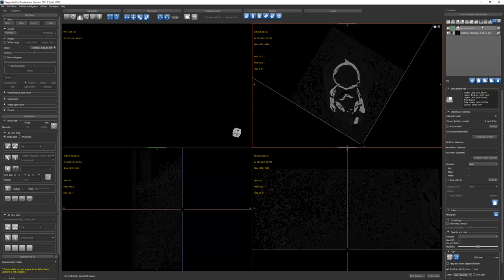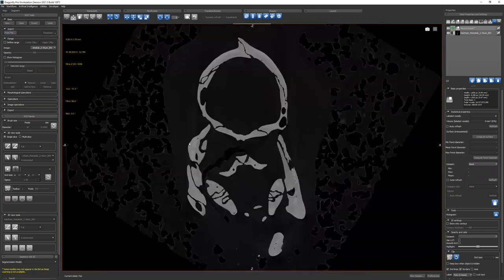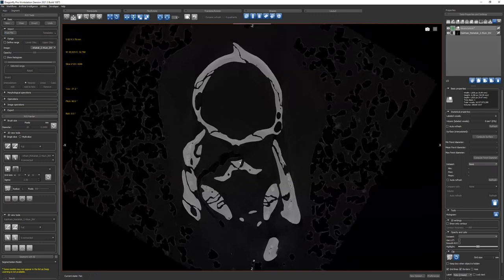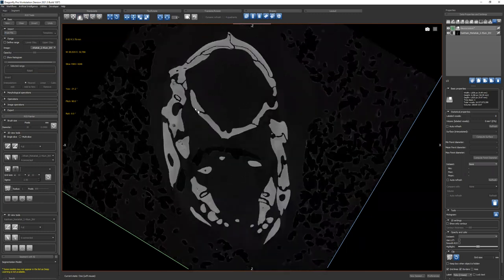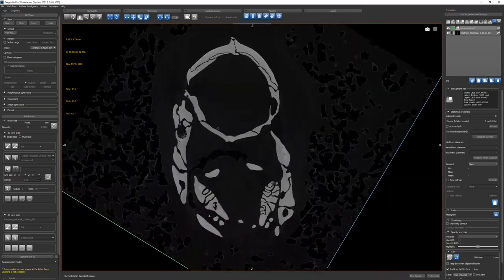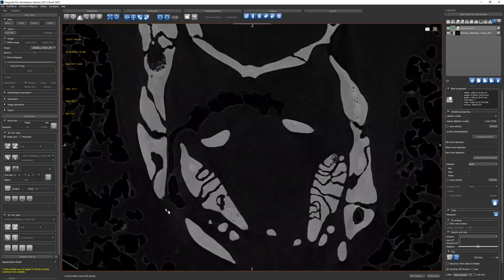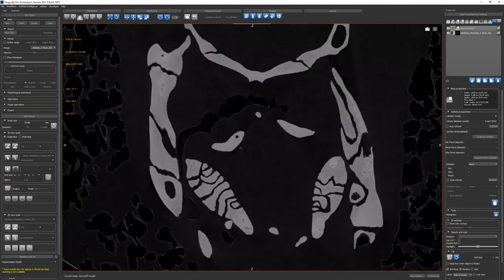So what you have here is, am I going too fast, by the way? This is okay. What you have here is an image, and you have thousands of them, and each image has lots and lots of pixels that are some value of gray, from dark, dark gray, which is black, all the way to white at the other end.